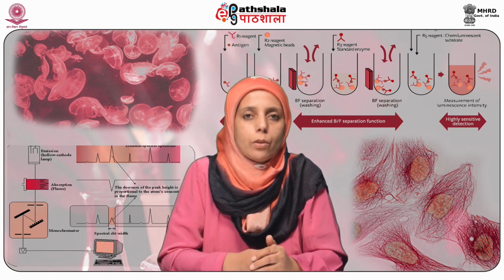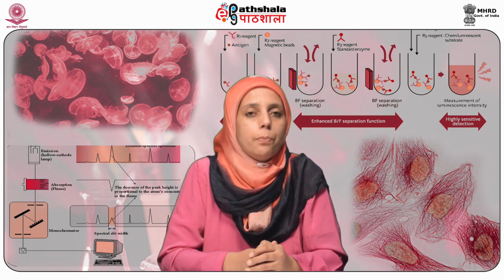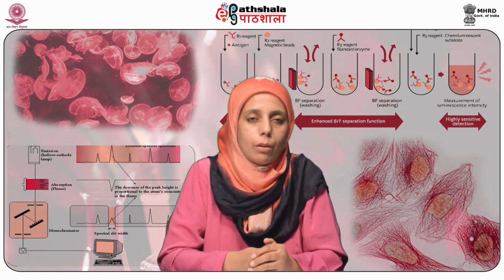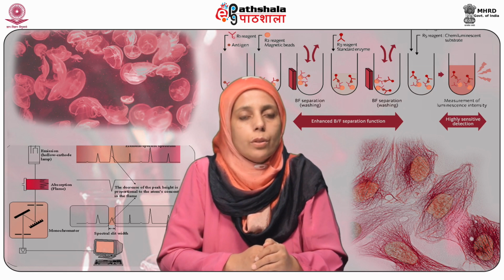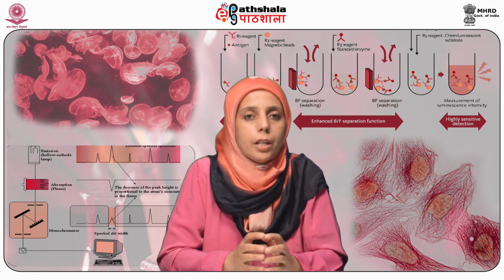Most fluorescence spectrometers use a high pressure xenon arc lamp. It produces a high intensity continuum light spectrum from 200 nanometers to 1000 nanometers. That means most of the visible range is covered in there. These lamps are designated according to the electrical power consumed, that means the amount of wattage used.